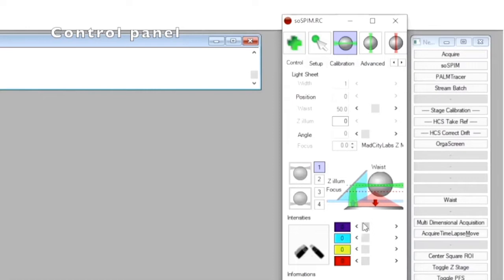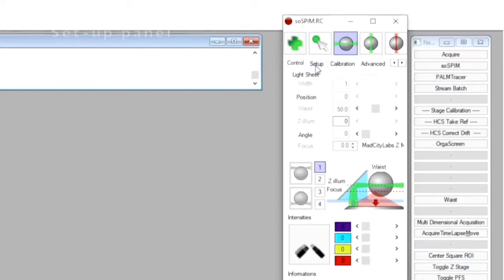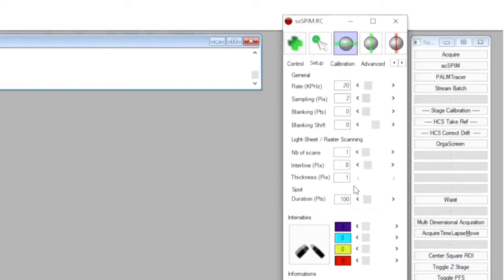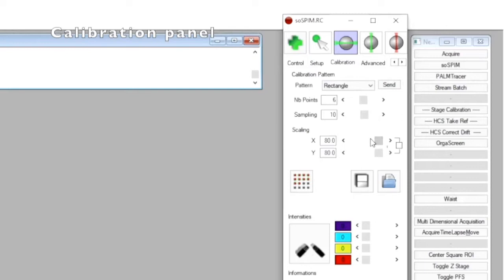It also includes a part to handle the synchronization of all the hardware with the camera to ensure optimal 3D imaging. We also have access to a panel to adjust the parameters of the galvanometric mirrors, such as their speed, and a panel allowing to calibrate the galvanometric mirror space according to the camera space, which we will use right now.